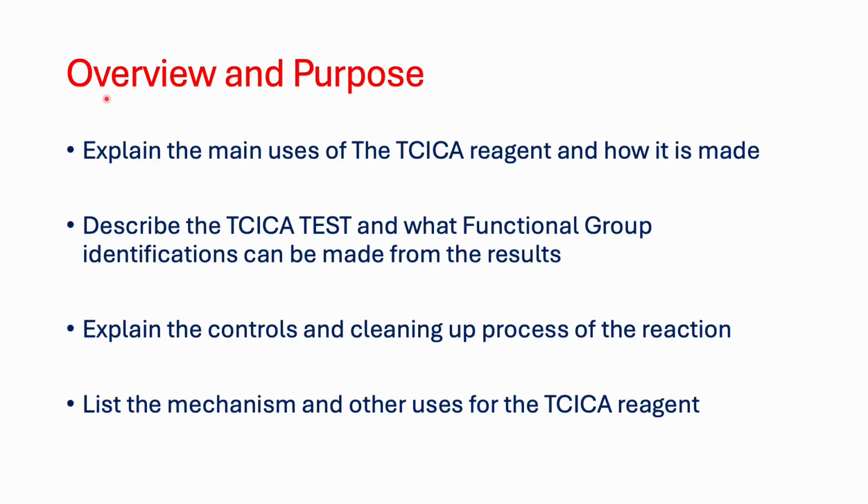As a general overview of today's video, I will explain the main uses of the TCICA reagent and how it is made. I will also describe this test and what functional group identifications can be made from the results. I will explain and go over the controls, the positive and the negative control, and how to clean up the process, and list the mechanism and other uses of the TCICA reagent.